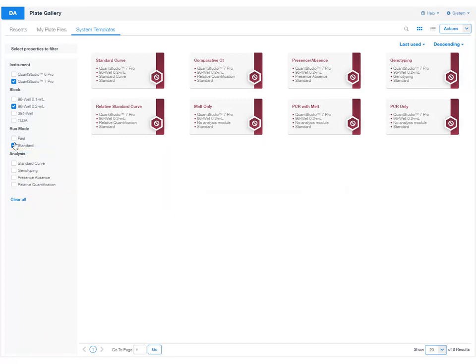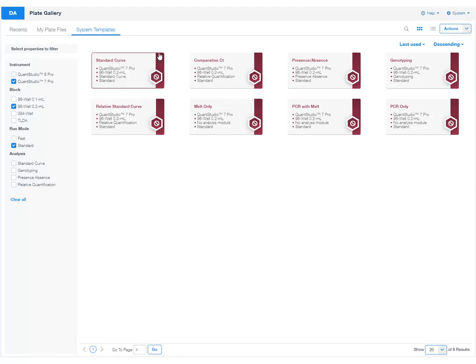Once you identify the correct template, click the icon in the upper right corner. Then select creating a new window, or click the system template to create the plate file in the same window.